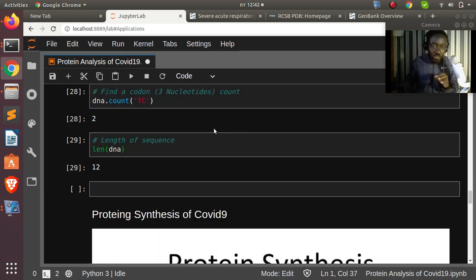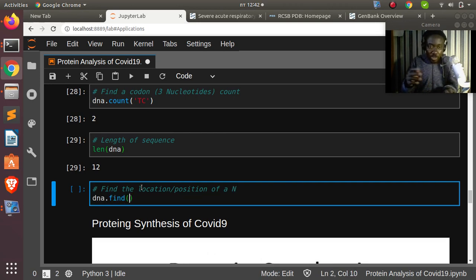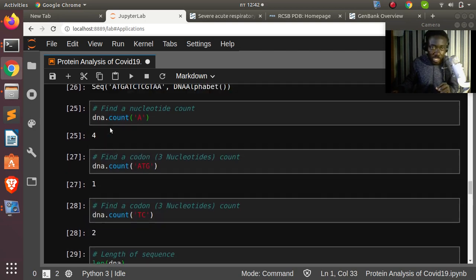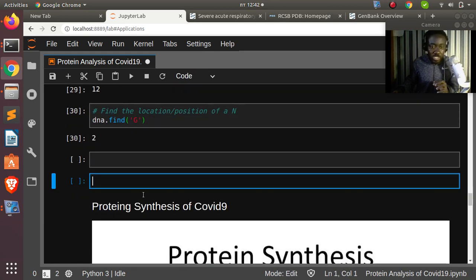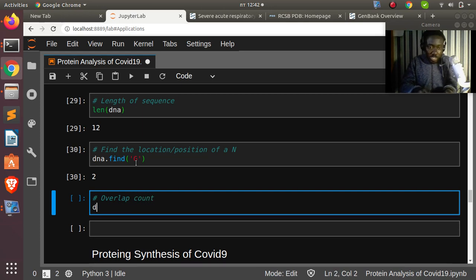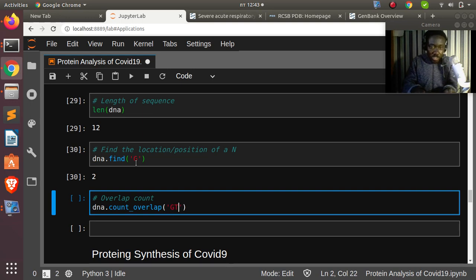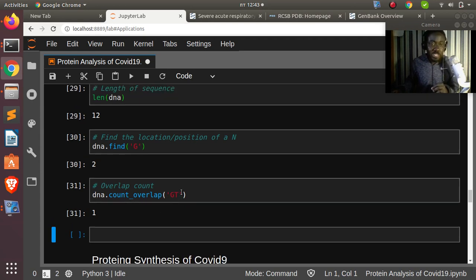To find the location or position of a nucleotide, use dna.find('G'), which returns index 2 — the first occurrence. You can also do overlap counting: dna.count_overlap('GT') returns 1. You can also use index() and other string-like methods. That covers basic sequence manipulation.